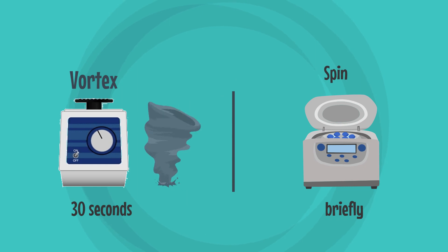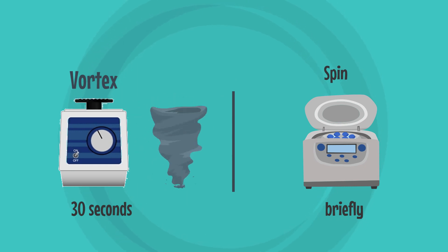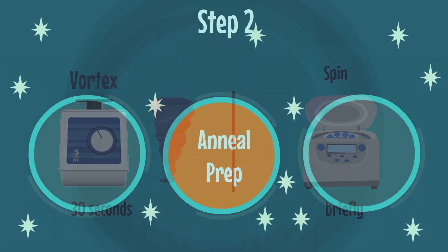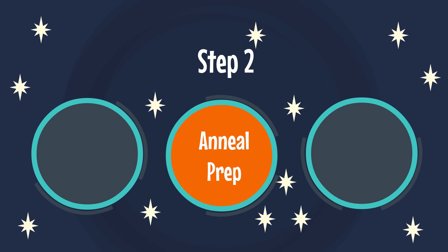Vortex 30 seconds and spin briefly. Step 2: Anneal Prep.